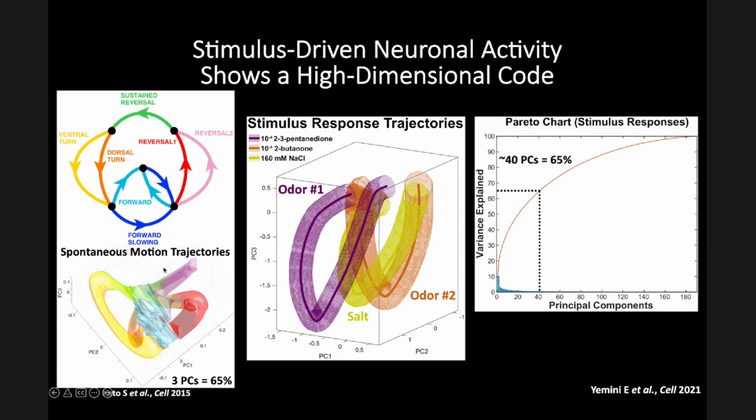The other thing here is that in this previous work, what we're showing you in the low dimensional space is just one worm. And why? Because the dimensions are the different neuron types. We didn't know what they were in this previous work. And so we could only project one worm into a low dimensional space at a time. But here I'm projecting 21 worm heads into one space and then collapsing them into a lower dimensionality.